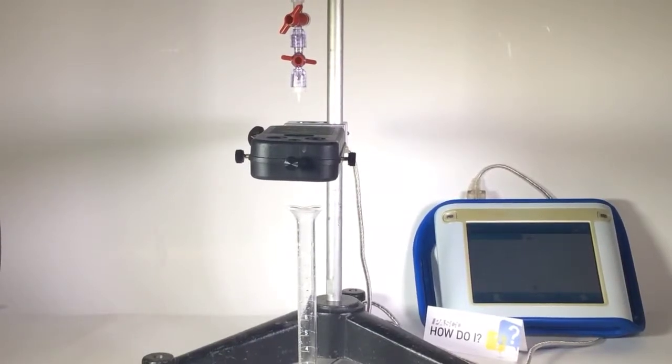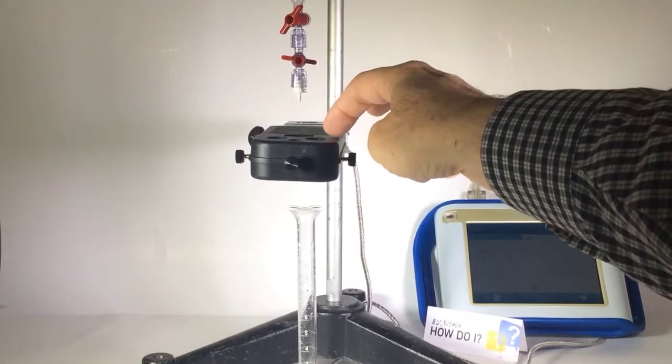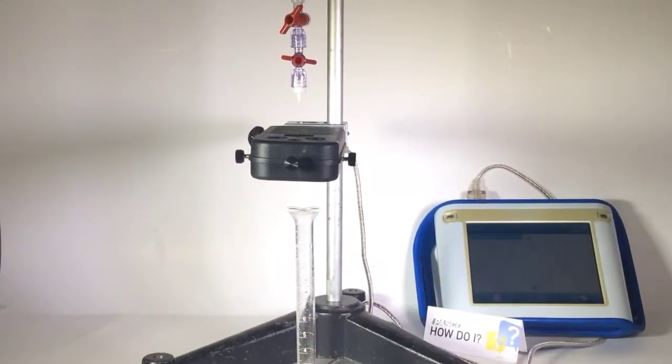How do I calibrate a Pasco drop counter? To do this I have already set up the drop counter so that the syringe drops through the drop counter and into a graduated cylinder.